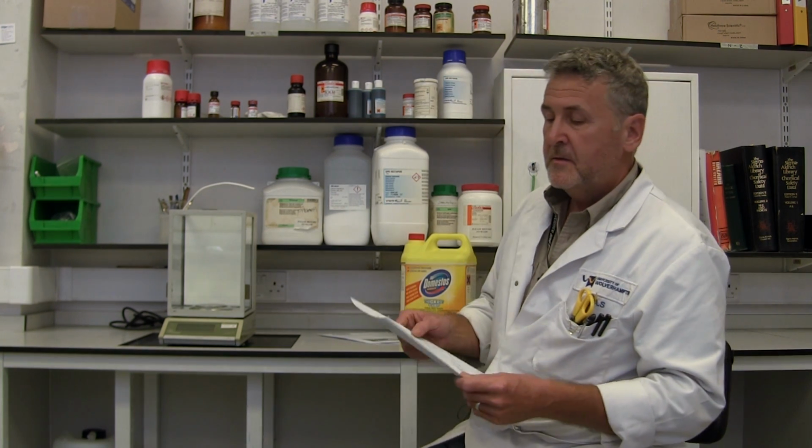So never leave out important information. A question you might be asking yourself is, can I cut and paste the information from the data sheets into my COSHH form? And the answer is no. This is a handwritten form, and you'll be asking yourself why?